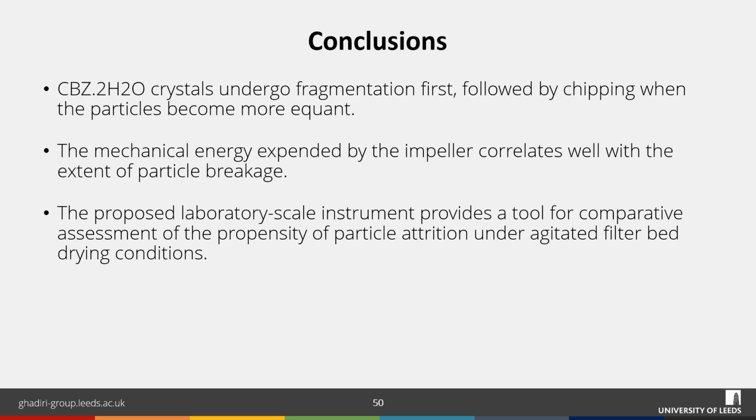The mechanical energy expended by the impeller correlates well with the extent of particle breakage. The proposed laboratory scale instrument that I've presented here provides a tool for comparative assessment of the propensity of particle attrition under agitated filter bed drying conditions.